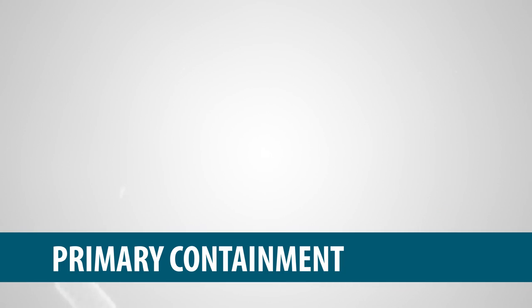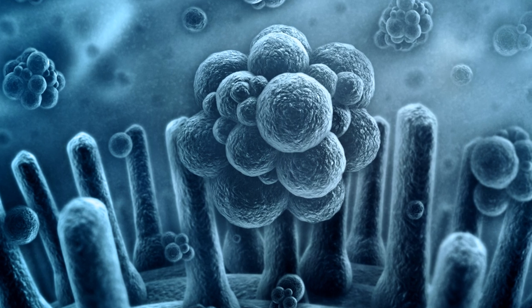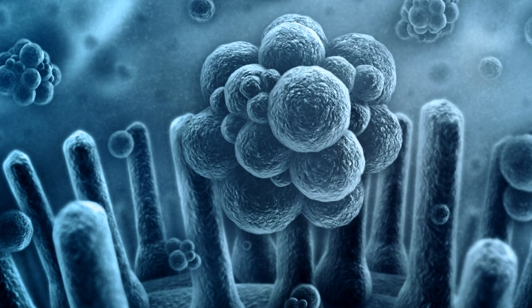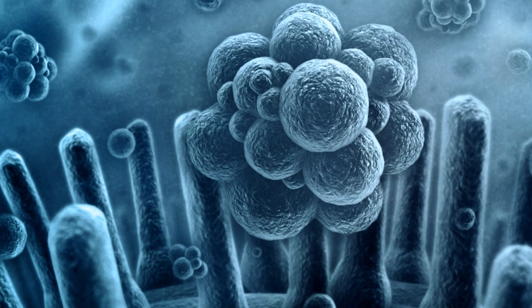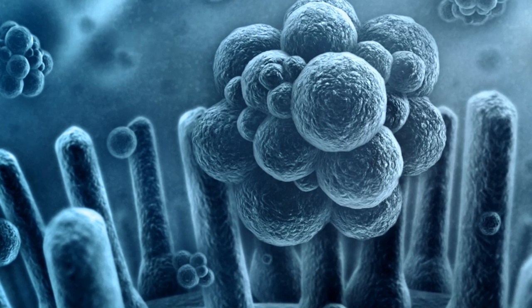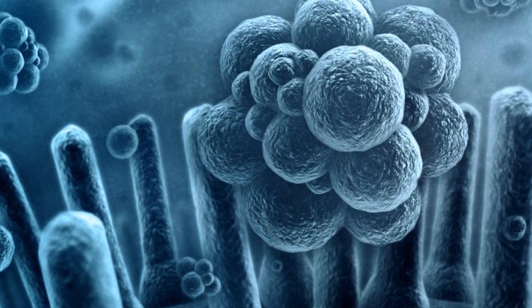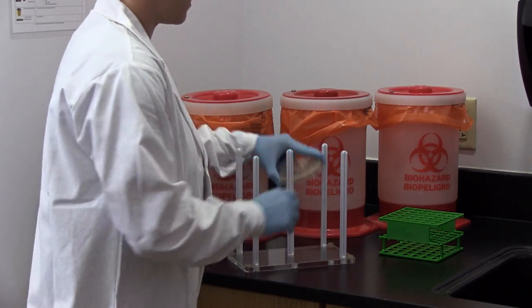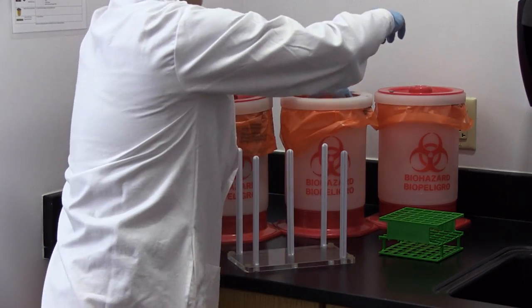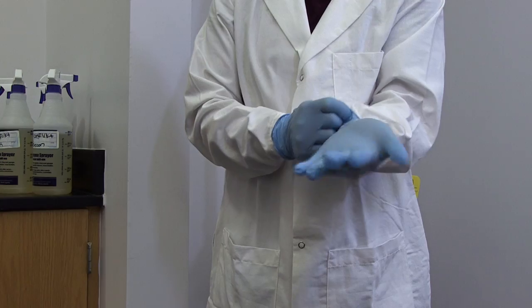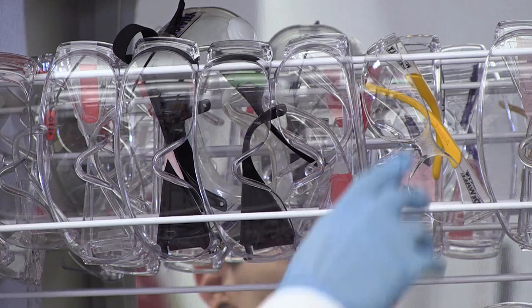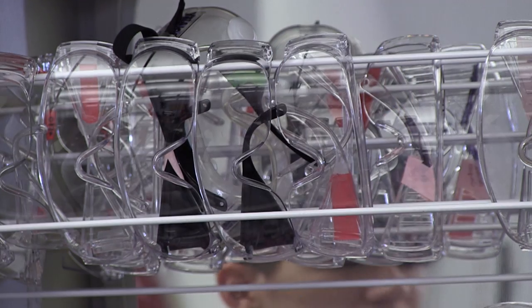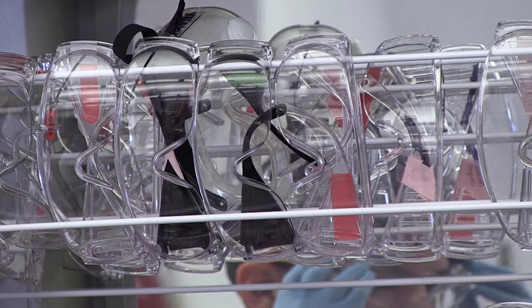Primary Containment concerns the protection of personnel and the laboratory environment from exposure to infectious microbes. Proper microbiological techniques, such as the safe transport and disposal of cultures, along with the correct use of personal safety equipment, such as gloves and safety goggles, go a long way toward accomplishing the goal of primary containment.